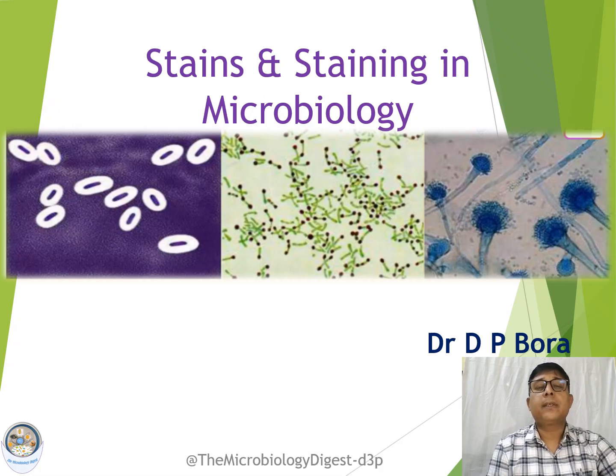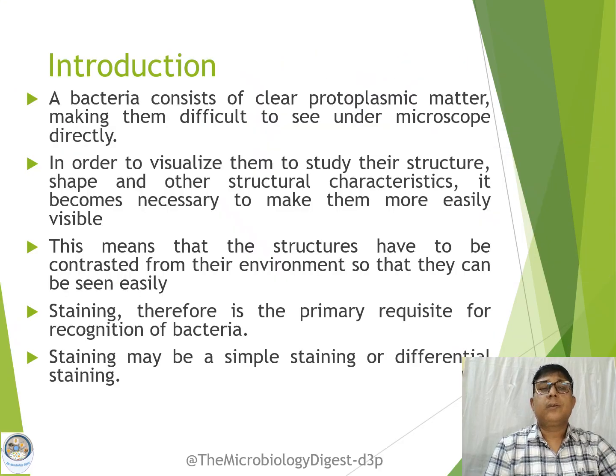So today we will be discussing another important topic in microbiology, that is stains and staining techniques. Staining procedure is one of the important prerequisites in any microbiological work. So why is it so?